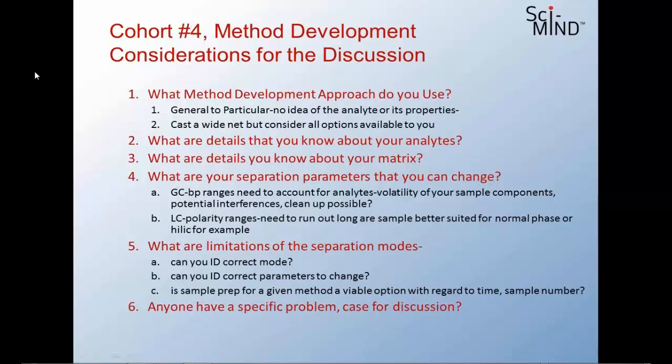You could have a mass spec selectivity where you're using a single ion monitoring mode, for example, or maybe an electrochemistry, an ECD detector. But there has to be some way that you could basically distinguish your analyte completely from the matrix, and if you need to do it quantitatively, this presents other challenges such as matrix effects. These will all come back to haunt you if you don't clean your sample up front first.